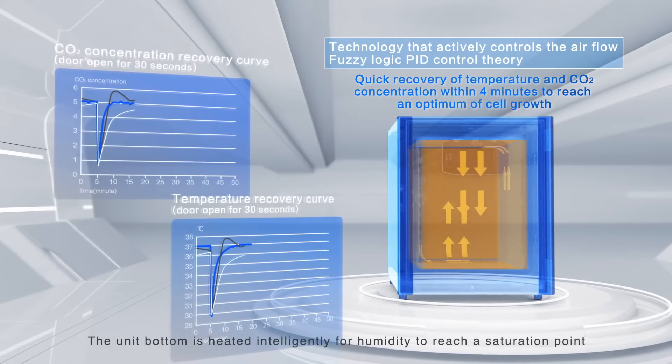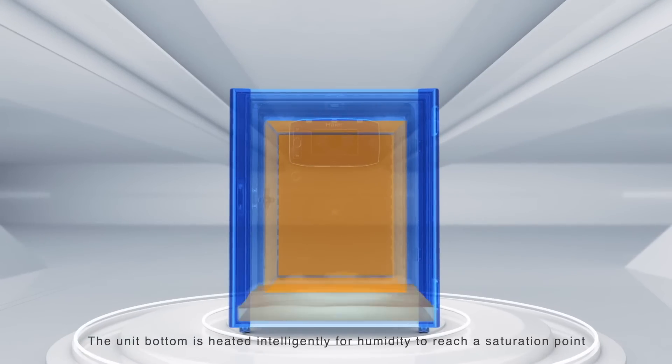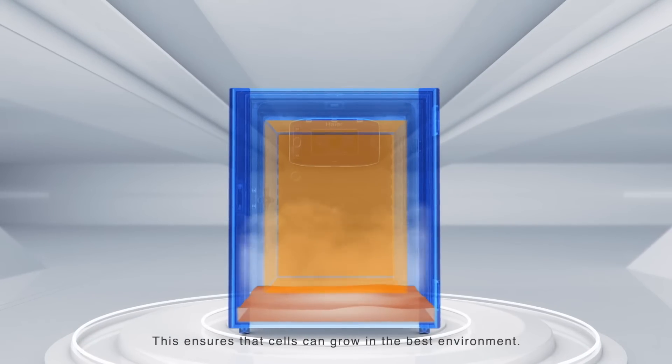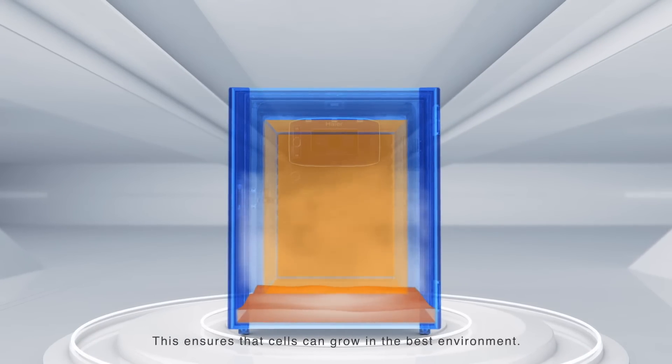The unit bottom is heated intelligently for humidity to reach a saturation point. This ensures that the cells can grow in the best environment.